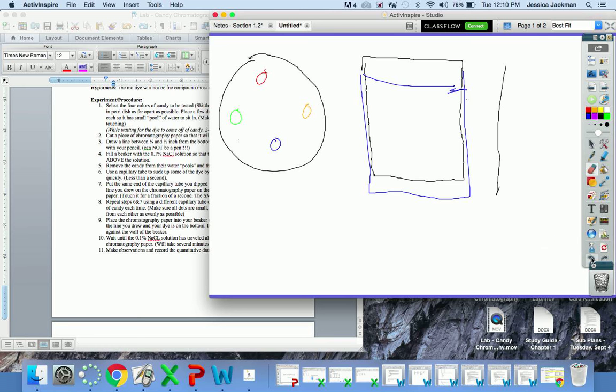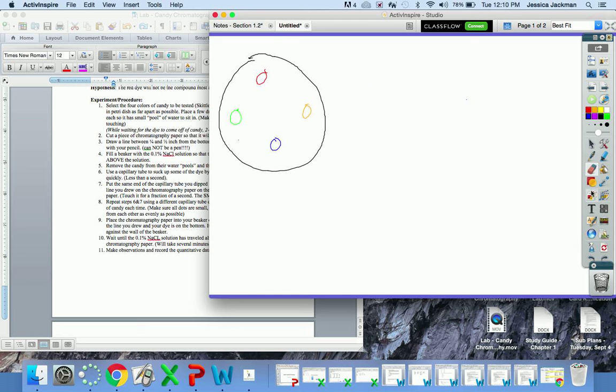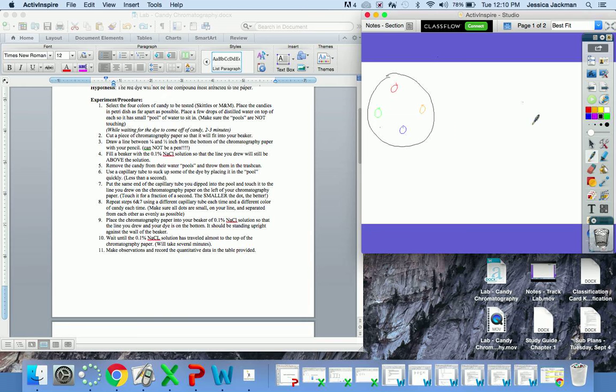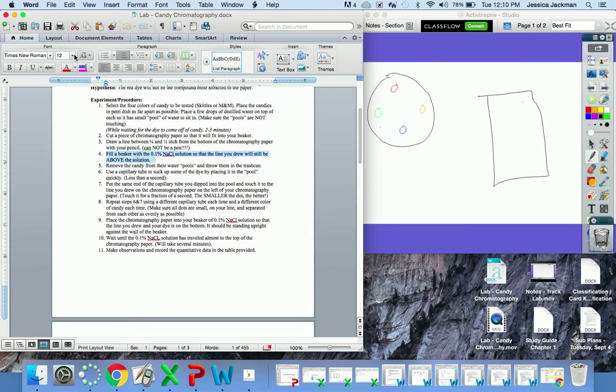Let's just undo these. Okay, so you're going to get your chromatography paper. So like this, okay? Actually what I want you to do is number 4 before you do number 3. So go ahead and do this one first. So you're going to cut a piece of chromatography paper. Then you're going to do number 4. So on your papers right now, I want you to draw an arrow or something for number 4 up above number 3. That way you remember.